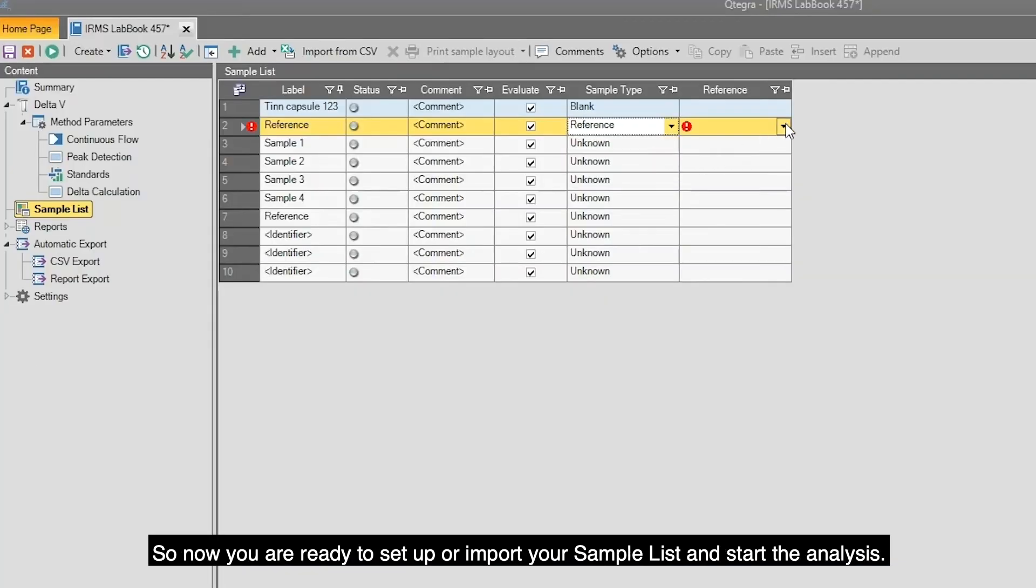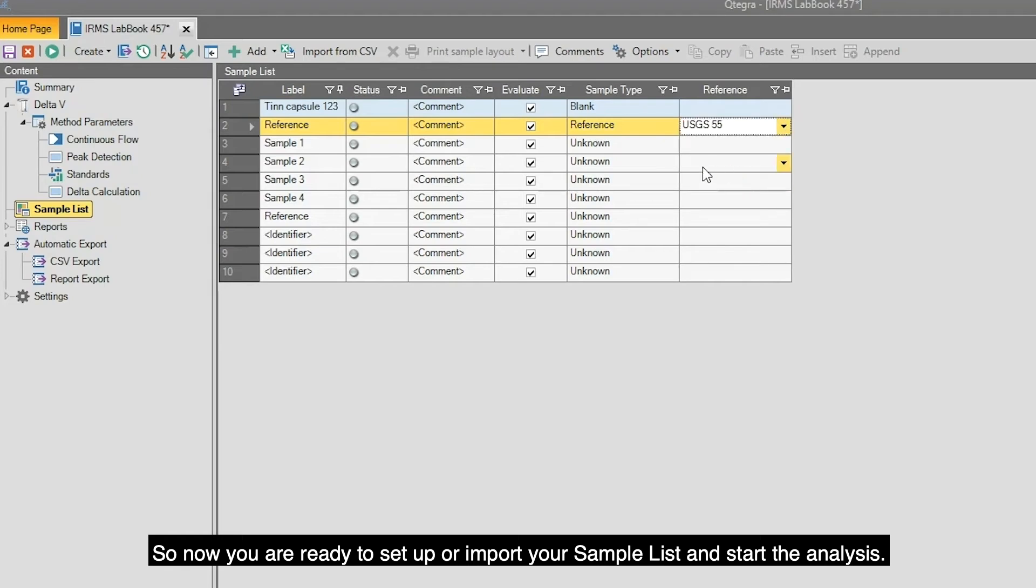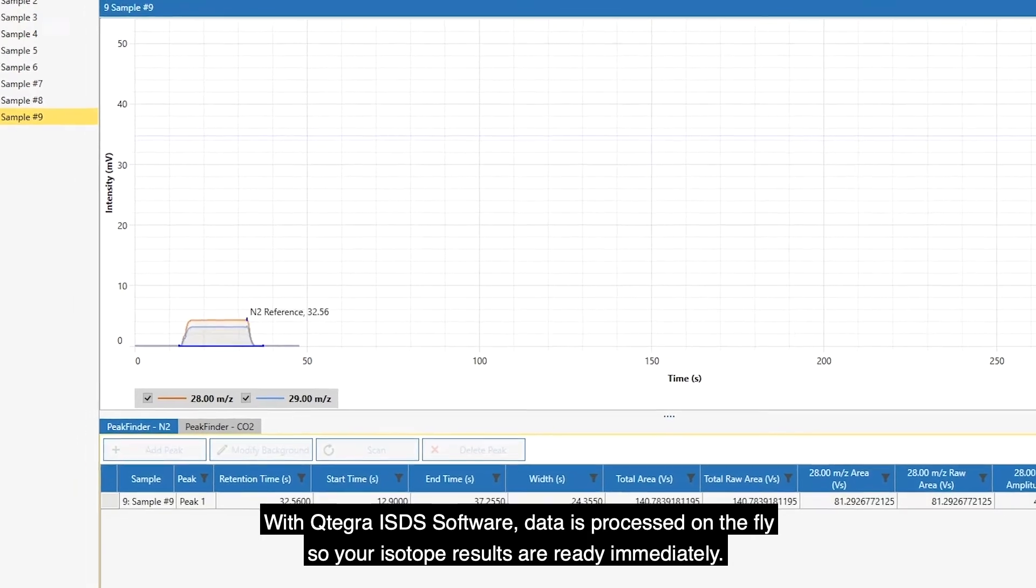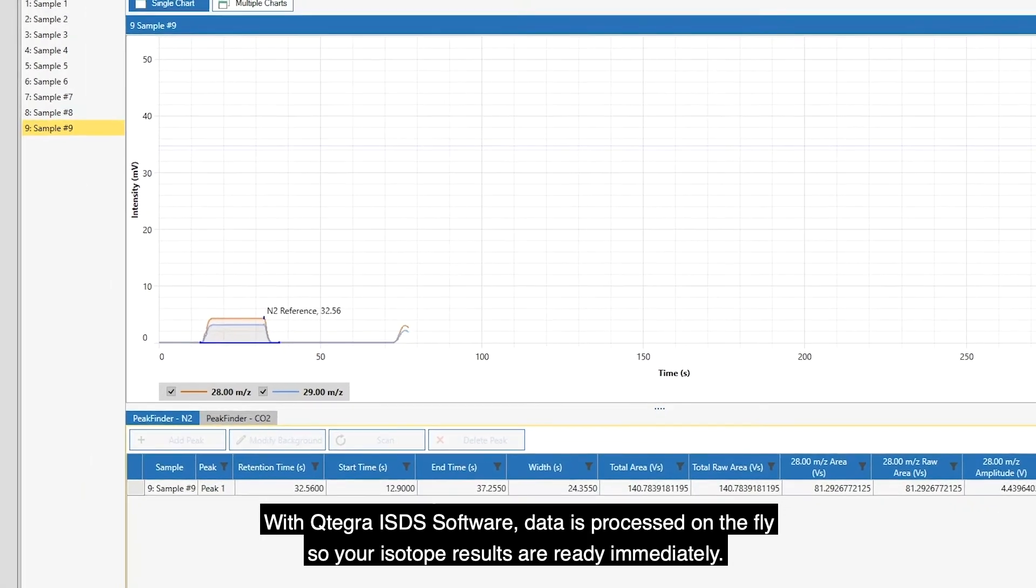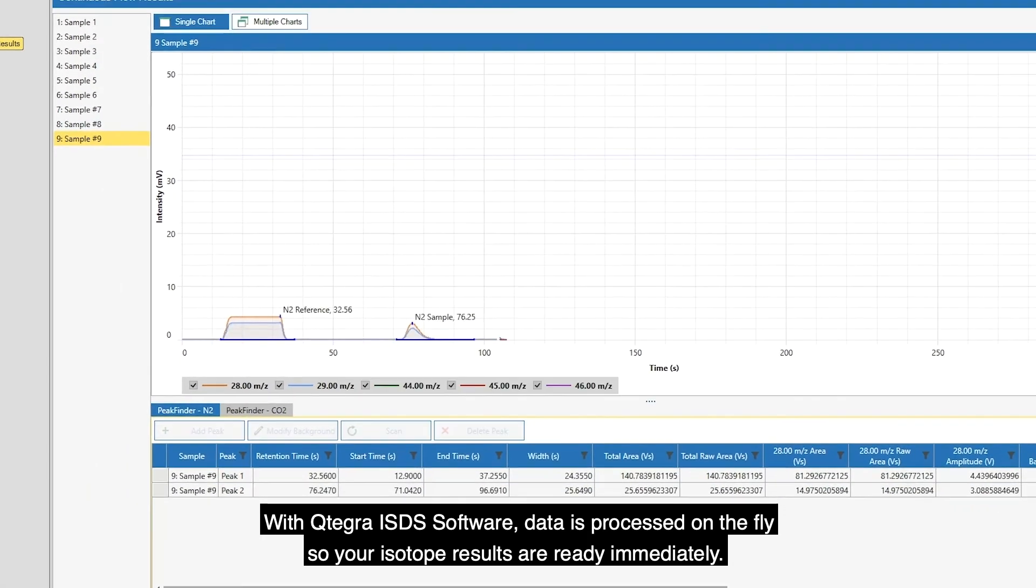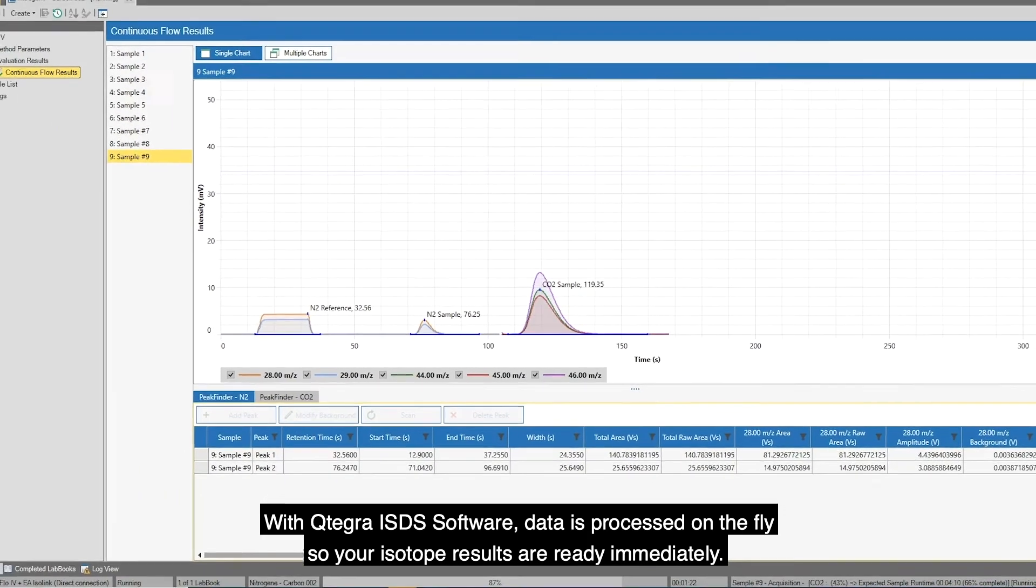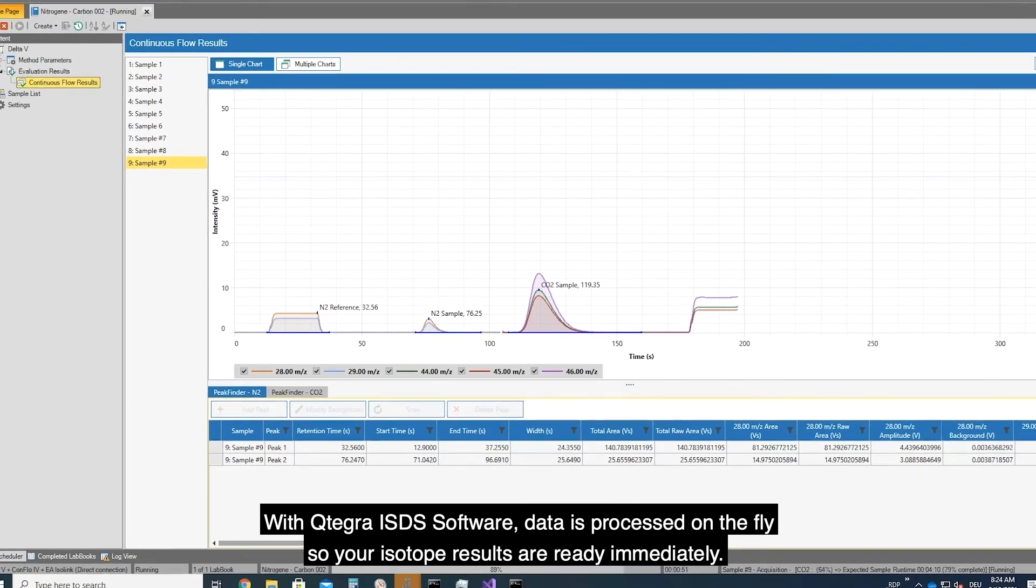So now you are ready to set up or import your sample list and start the analysis. With Qtegra ISDS Software, data is processed on the fly, so your isotope results are ready immediately.